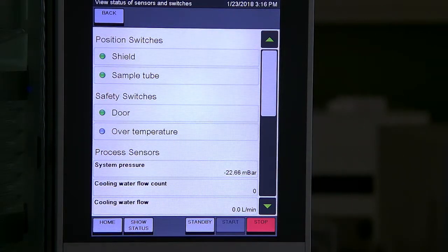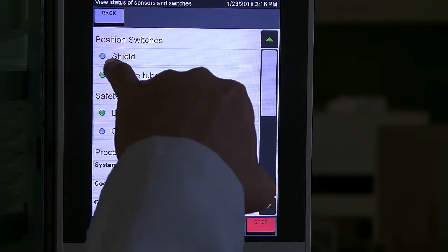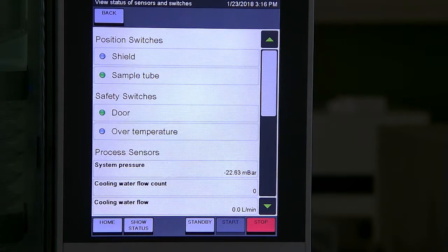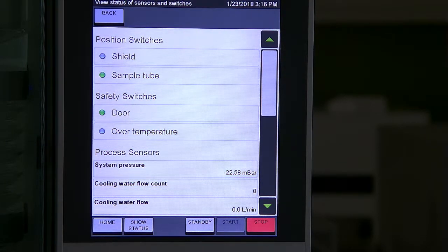In the sensors and switches screen we have a number of sensors. If I open this door for the sample tube you can tell that the shield sensor has gone gray rather than green.